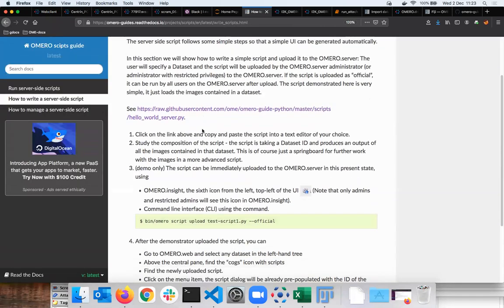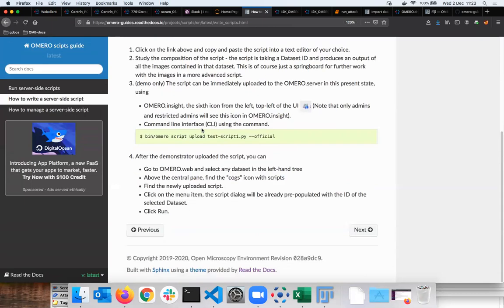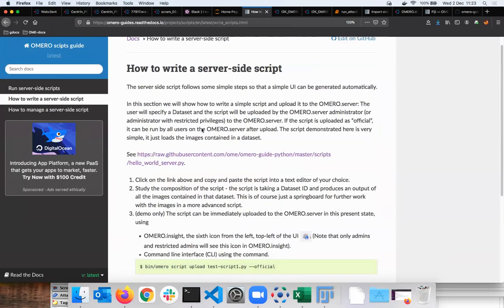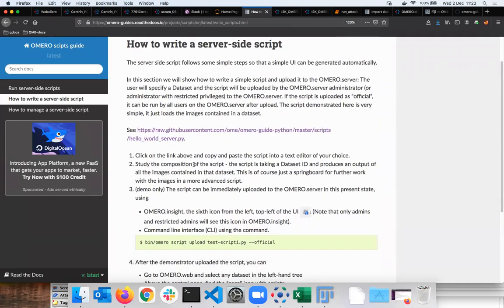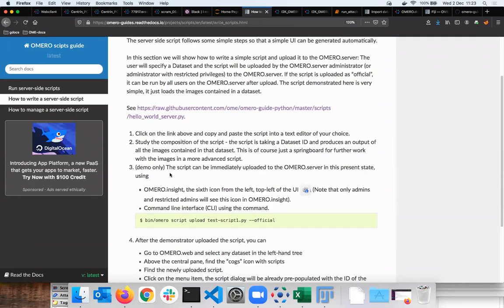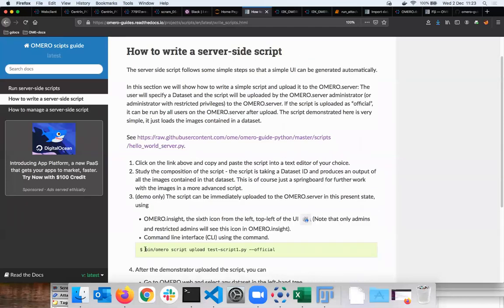Here is kind of like a hello world example, which really with minimal Python skills, you would be able to follow. And in this walkthrough is described how you then upload such a script into OMERO.